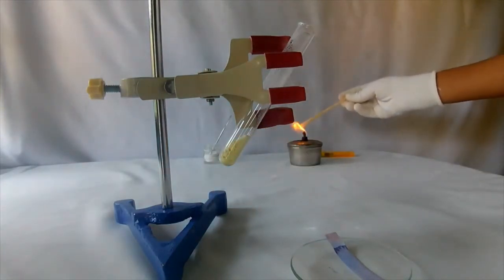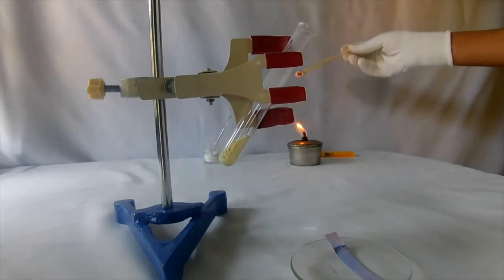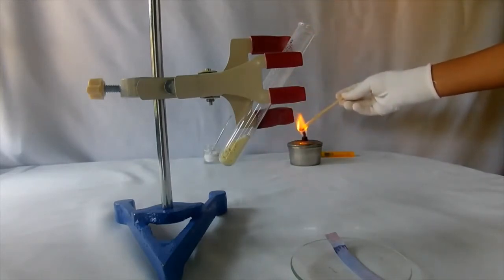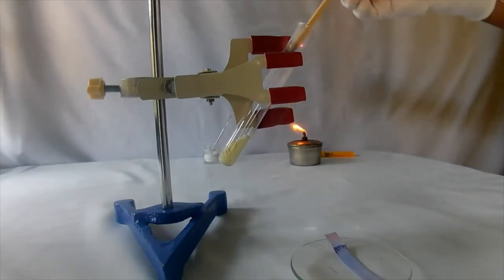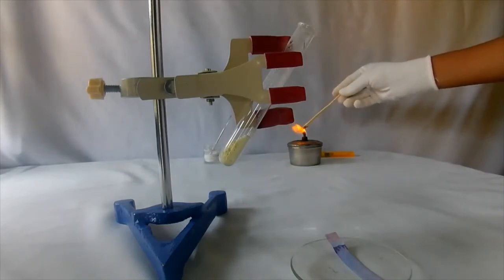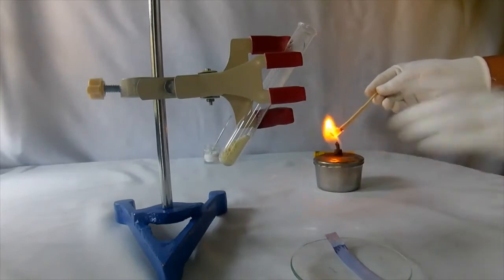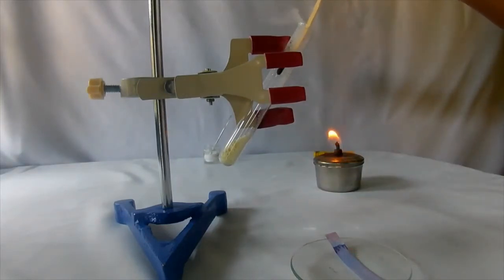The color of litmus paper changes to red, indicating that the gas formed is acidic in nature. Now, introduce a burning splinter into the test tube. The splinter extinguishes. The gas liberated is carbon dioxide. See, the splinter extinguishes.